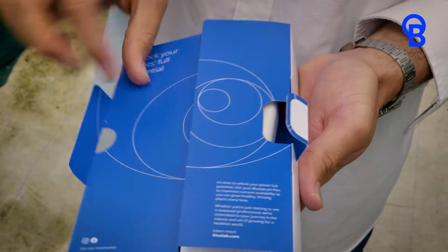Our pens are all designed here in New Zealand with the user in mind. It's designed to be held in the hand — not a lab pen, but an actual pen for your use.